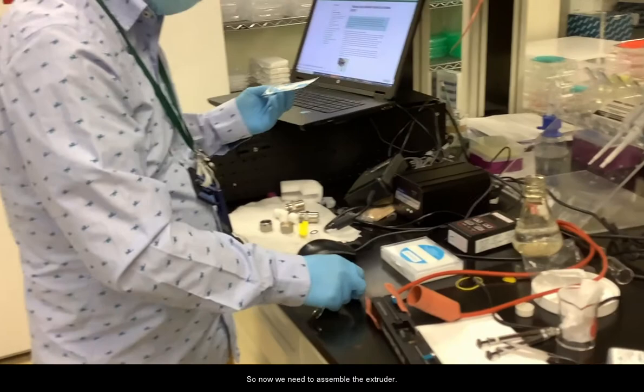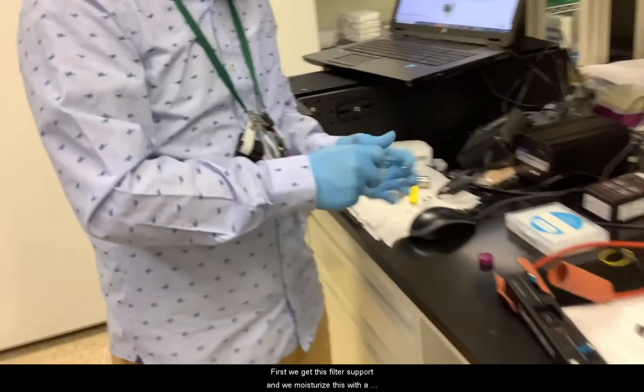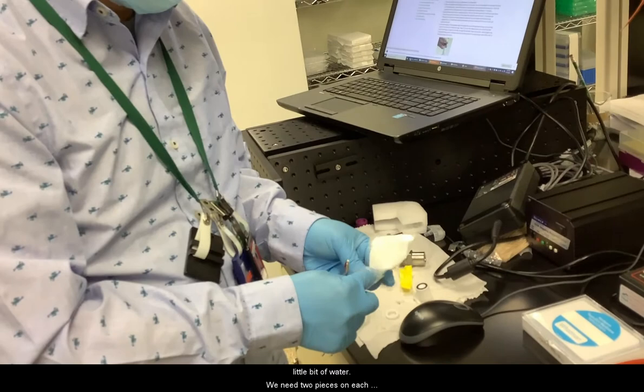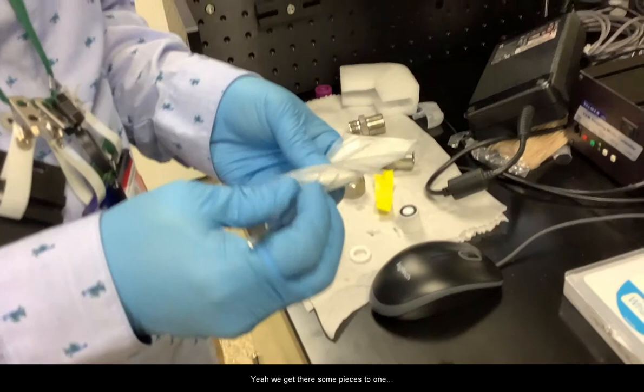Now we need to assemble the extruder. First we get this filter support, and then we moisturize this with a little bit of water. We need two pieces on each side.